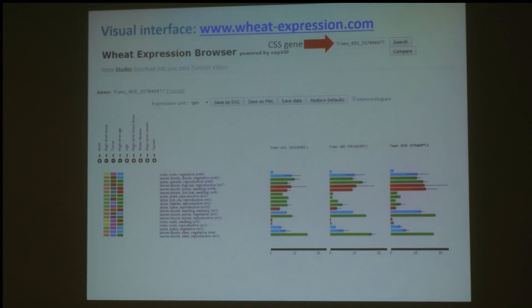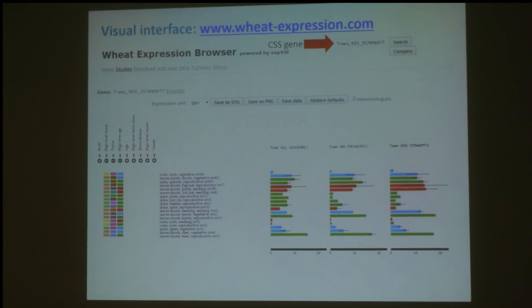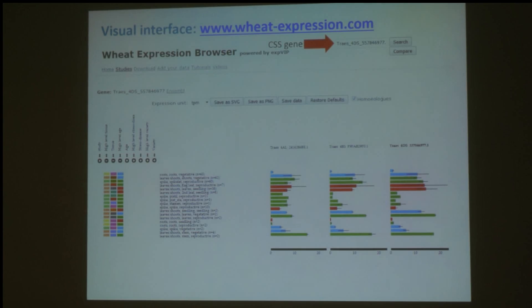One more thing to mention: this expression browser currently only accepts CSS gene names, which was the first gene name set available. That's why it's important to be able to convert from the TGAC gene models into the CSS gene models. We are planning to update this expression browser to the new TGAC gene models — that's a work in progress and we hope it will be available in the next month or so, so you'll be able to search with either a TGAC or CSS gene model.